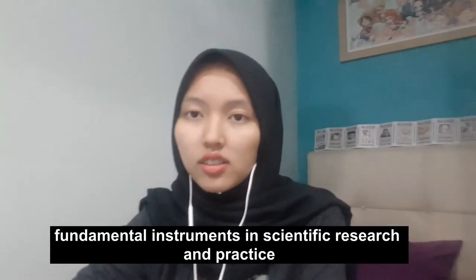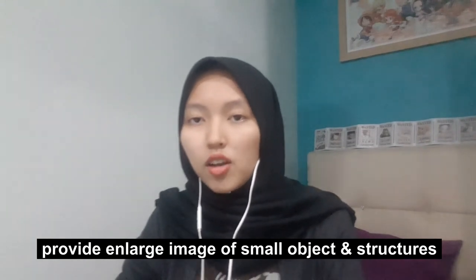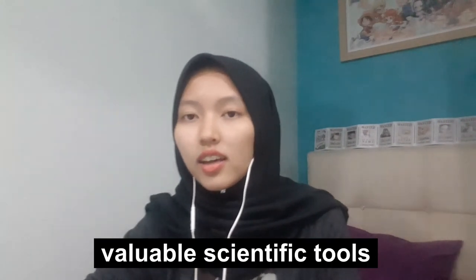Stereo microscope, also known as dissecting microscope, is a fundamental instrument in scientific research and practice. They provide enlarged images of small objects and structures, which are too small to be seen with the naked eye but too big to be analyzed through a compound microscope. Stereo microscopes are also used in dissection and microsurgery, as users can control the working distances. With complex features and advanced capabilities, microscopes are valuable scientific tools that can facilitate the accumulation and dissemination of knowledge, transforming the world of science.